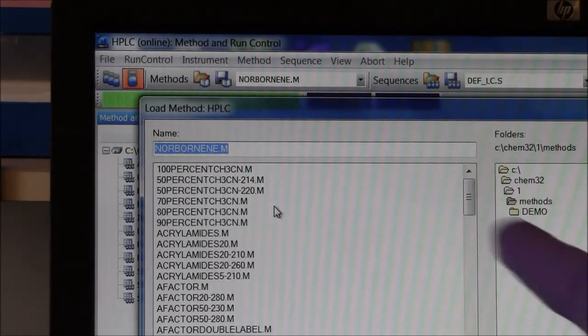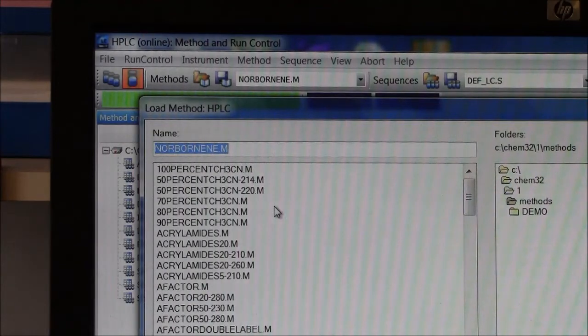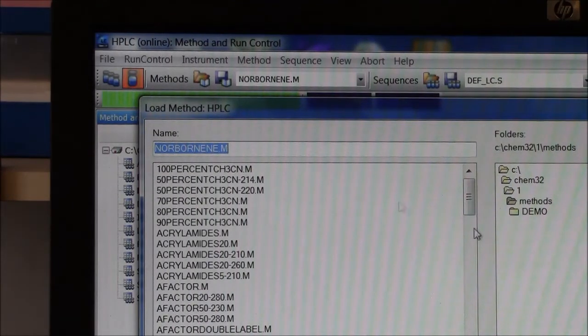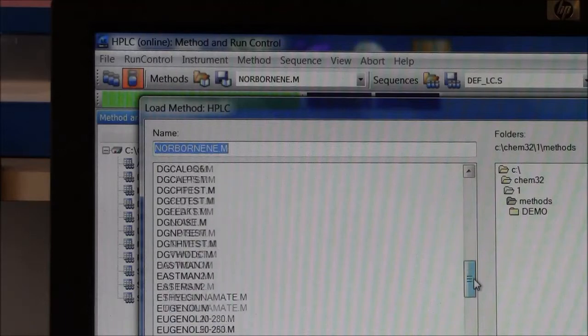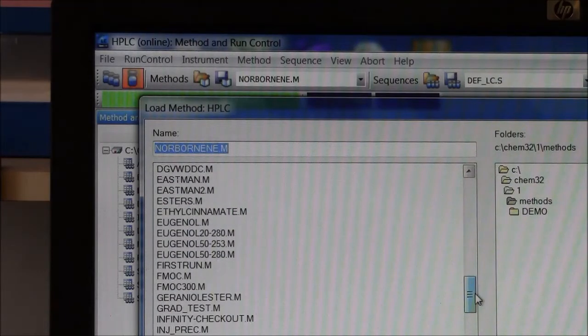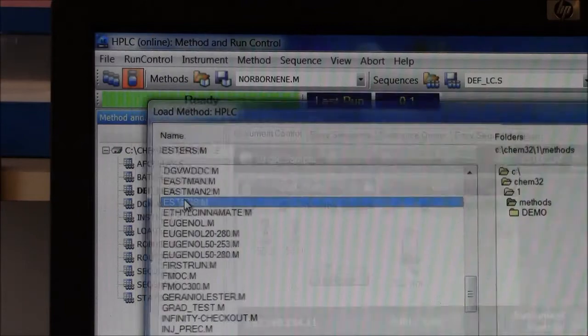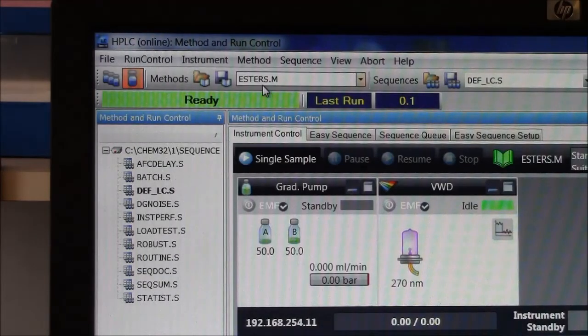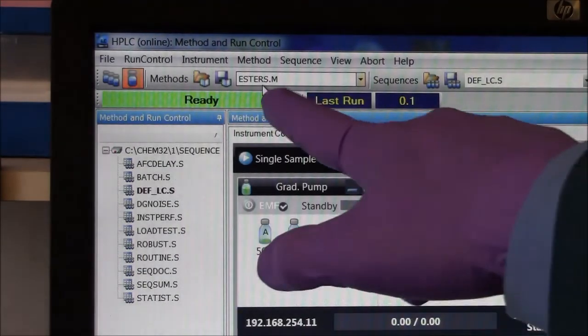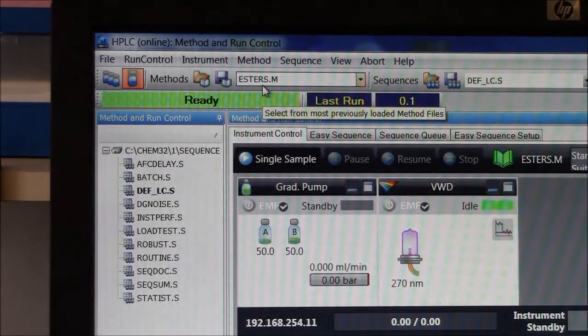We have maybe a hundred or so different methods here, so I'll scroll down until I get to E for esters, and here's esters. I'll click that, double-click, and now up here it should say esters.m. M is for method.